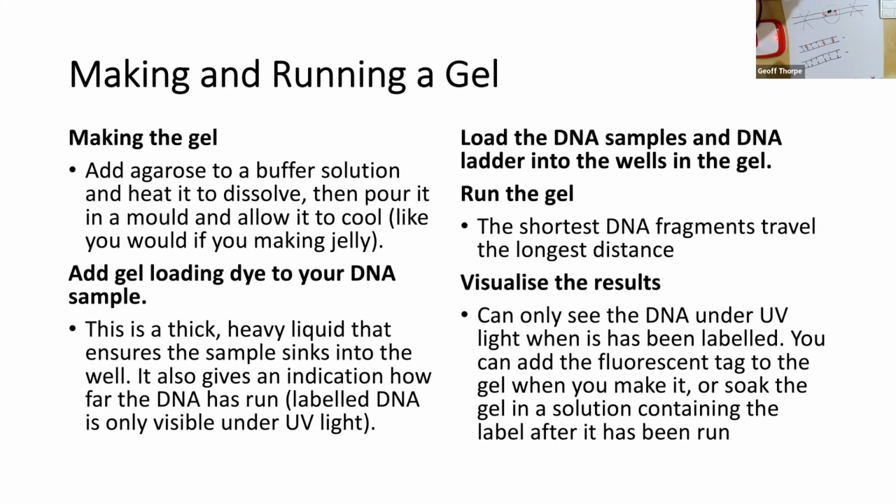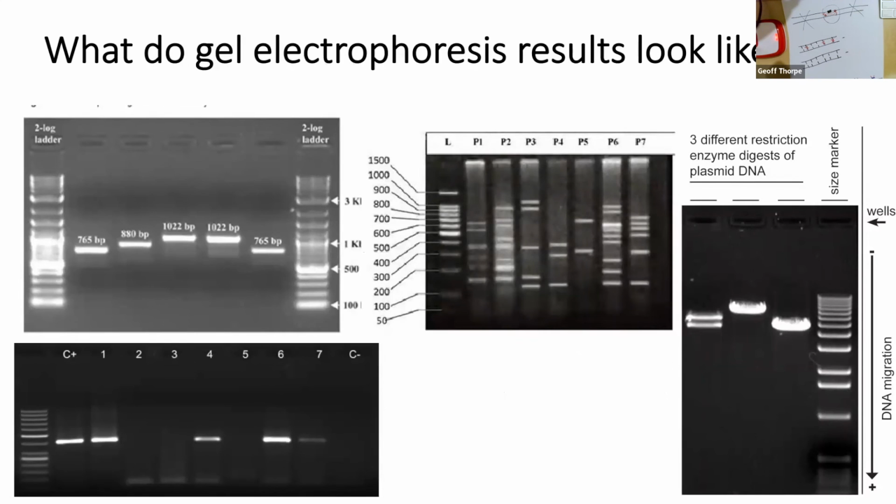Actually, how about I jump back because I didn't specify that. Let's use this one because I've got numbers. With our DNA ladder here, if we want to determine the length of any of these bands, let's look at this band, for example. I want to know how big that is. I'll refer back to see how that compares with the DNA ladder, and it's showing it's between 400 and 500 base pairs.